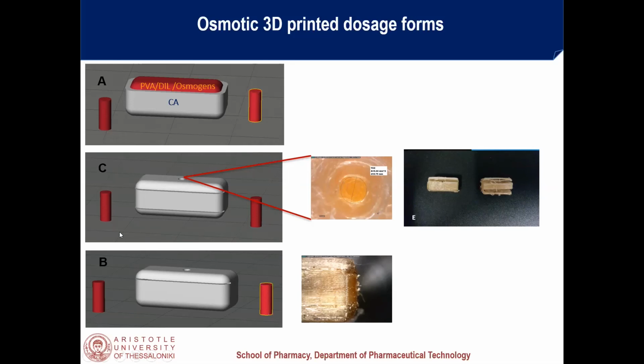However, in our approach, we had two small modifications with the design. And you can see it here in the figure. The tablet could open. It wasn't like an oyster-like dosage form. So it could open in the first case, the B tablet, only from the top, and when we had the C form, it could open from both sides.